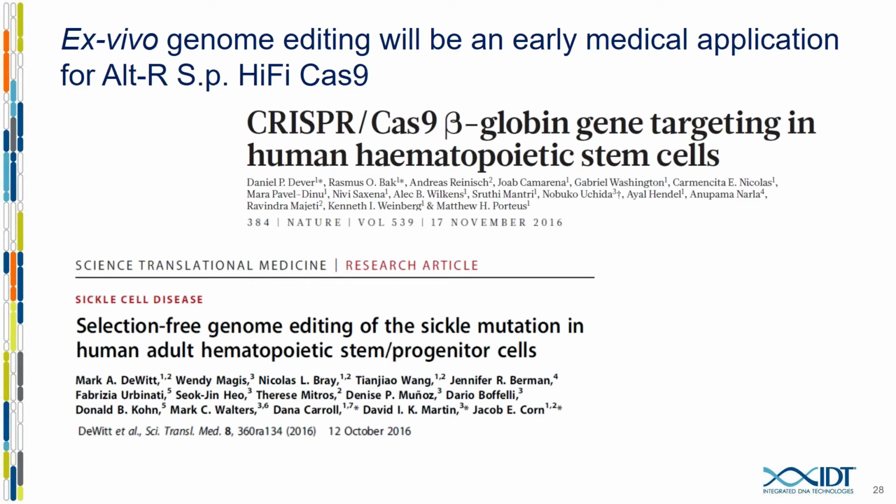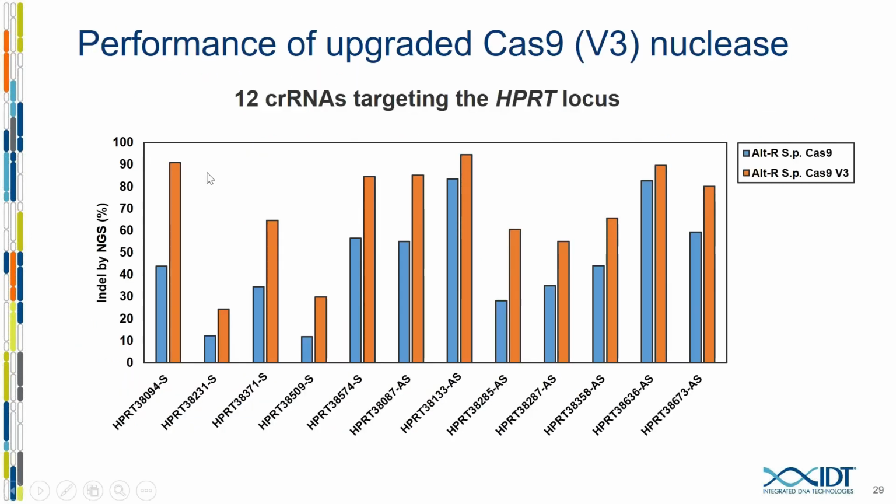And we're always asking new questions and trying new things and working to improve things. So I'm actually very excited to give you some data showing you the improvements we've made to these proteins. And we'll start with the wild type Cas9, where we've actually increased the editing efficiency by making modifications to the linkers and NLS sequences that surround Cas9 delivered into cells.